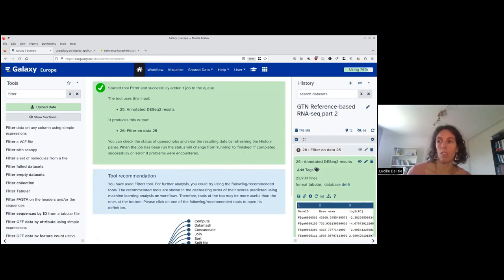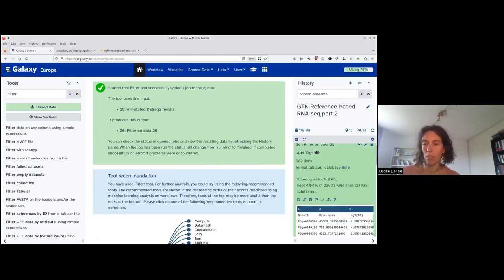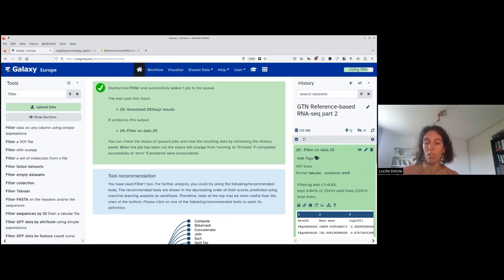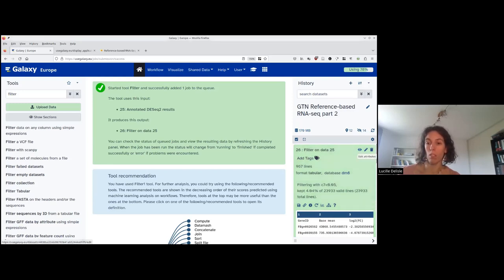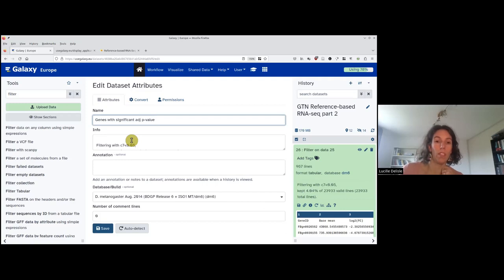The filtering is done. We can click on the filter to see details — we filtered using C7 below 0.05 and kept 4% of the lines. At the end, checking the output, we have 967 lines. Since we have a header, that means we have 966 genes that are significantly expressed. We rename this output by clicking the pencil to 'genes with significant adjusted p-value' and save.